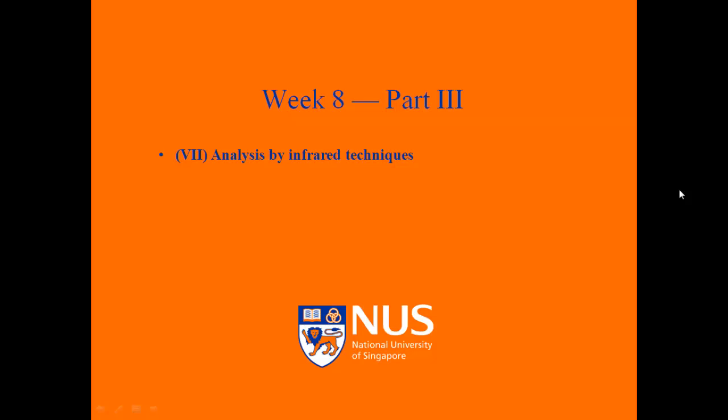Welcome to part 3 of this week's online lecture. In part 3 we will discuss analysis by infrared techniques.